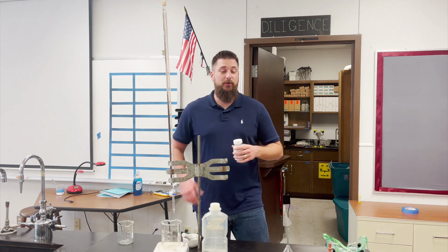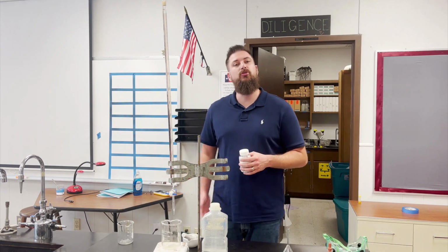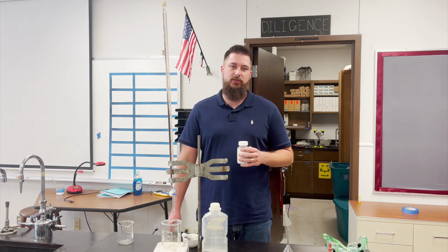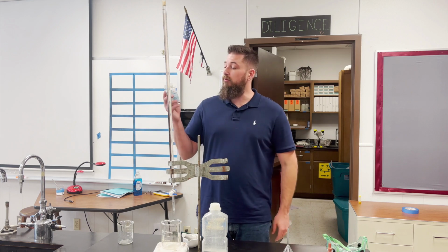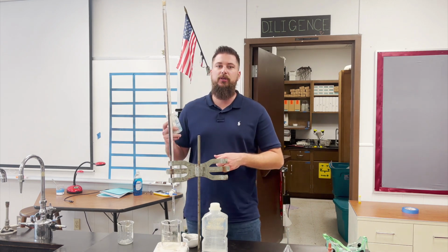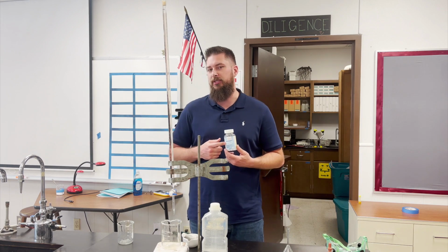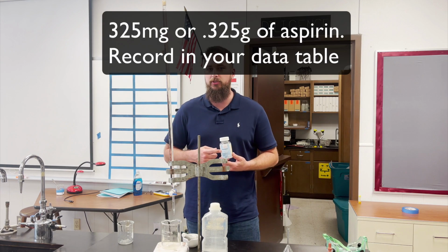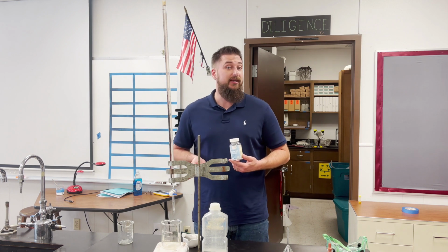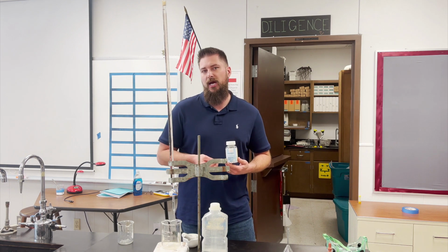All right, so today what we're going to do is a titration to analyze the contents inside of here. I've got a bottle of aspirin, and the bottle claims that there's 325 milligrams of aspirin inside. So what we're going to do is verify that that amount is inside of there.